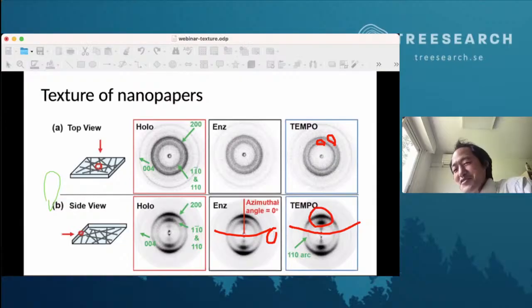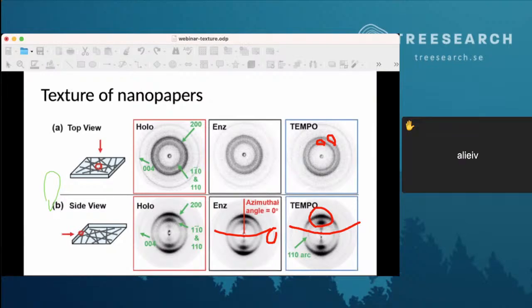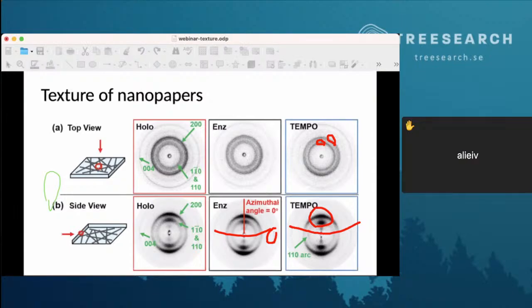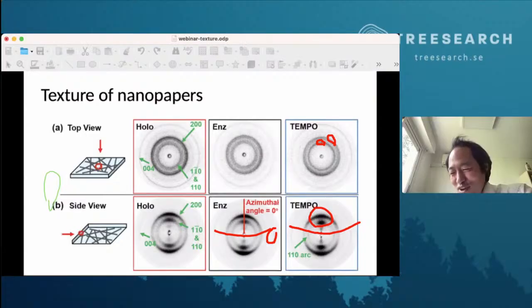Yes, sometimes, in a very special case, like paramylon, which is a beta 1,3 glucan. In this case, we see some streaks, probably due to the dislocation of certain planes, like what you have in an inorganic system. But to see this kind of thing, you need a fairly organized system. So it's rather rare, because most polysaccharide systems are very little crystalline. But in some cases, yes. So it's possible in semi-crystalline material, if you look at some exotic sample.